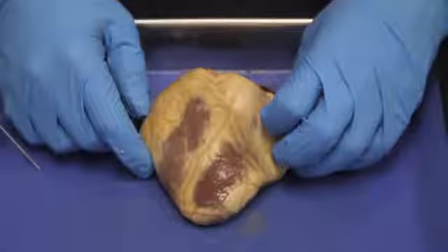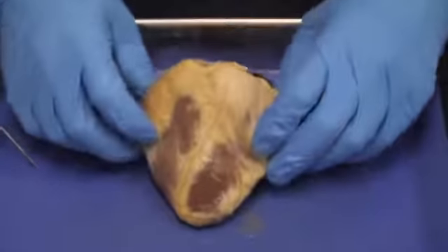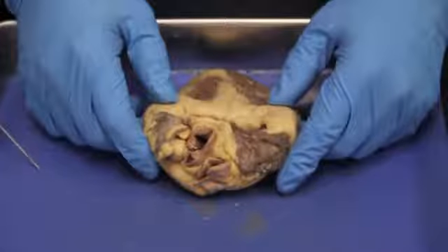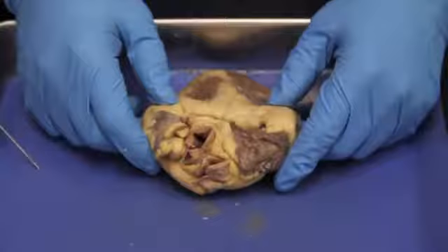We need to identify the vessels that are located around the heart. So the best place to see those vessels is if you flip your heart upside down with the apex pointed toward you. And now I can see several different vessels. I encourage you to poke your fingers in them so it'll help you remember better.